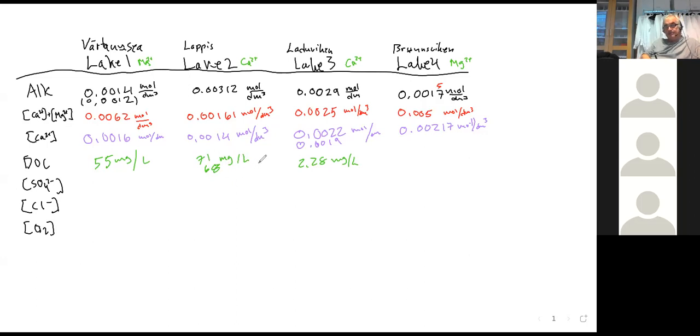Yes, but we also did a blank, and we got quite a lot in the blank as well. I don't quite remember, I think it was 17. So 17 in the blank, so maybe not so perfect. Was it a blank with deionized water? Yes. It was kind of strange because we were very satisfied with the numbers being so close together, and then we had a blank that was not so good.